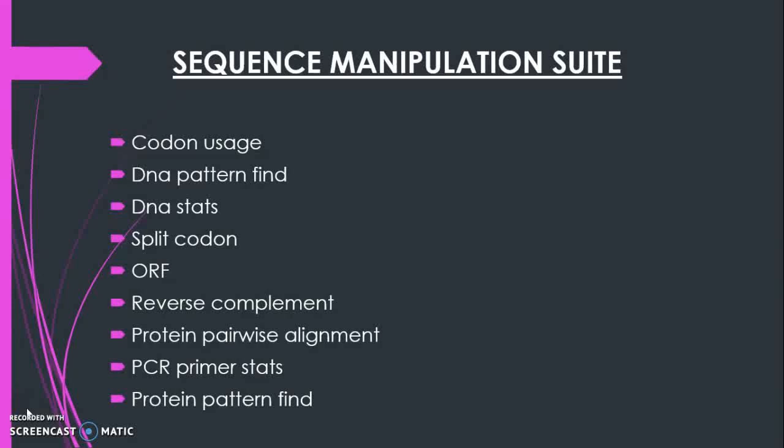In this video, I am going to show how to analyze protein and nucleic acid using the tool Sequence Manipulation Suite.